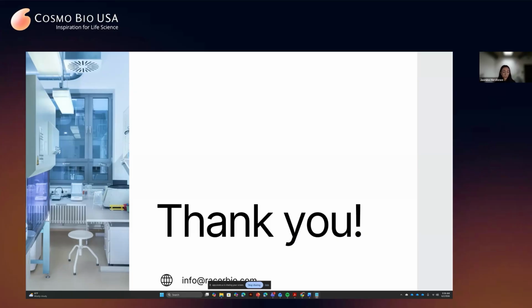The idea would be to have a tool where not only can you check your work. So if you had an assembly that was a mystical failure, this is something we hear all the time in the field. You can read about it on Reddit too, right? Mysterious cloning failures. The idea would be to use more advanced bioinformatics to assess those failures, figuring out past failures, but then also finding optimal split points and making sure that the sites are unique with low secondary structure, optimizing that for the Gibson assembly reagent. Or even telling you when Gibson assembly might not be the right fit for your assembly and you may need to try another technique.